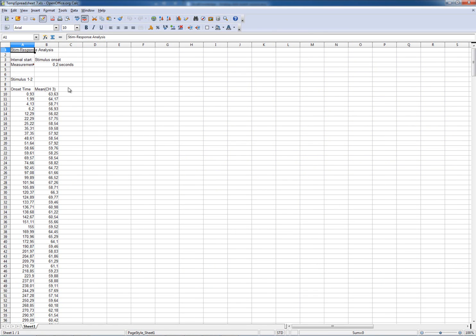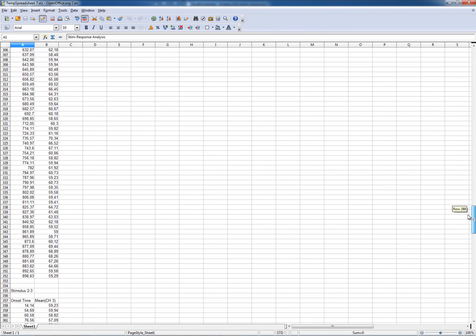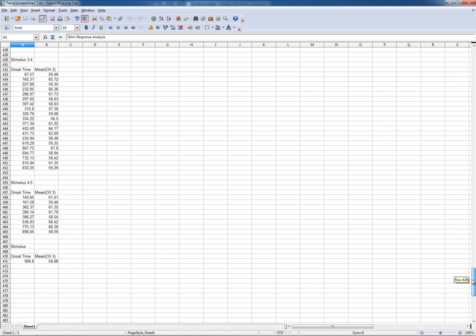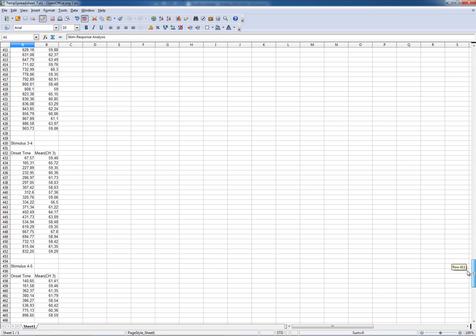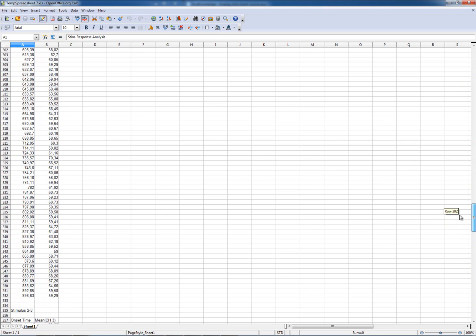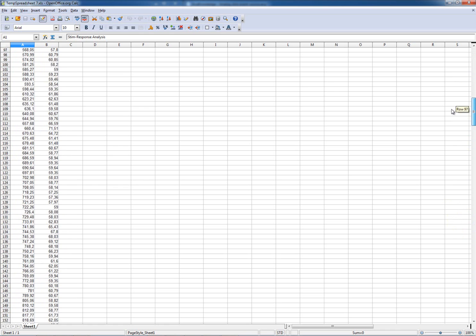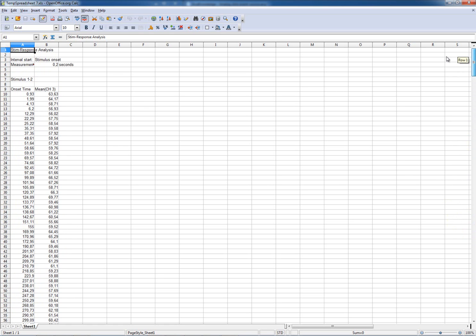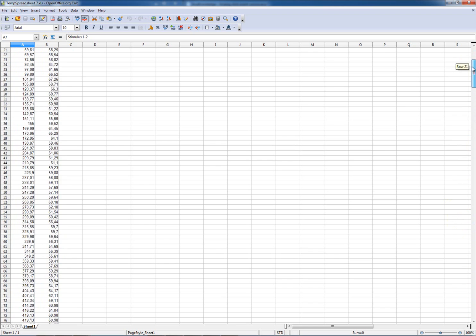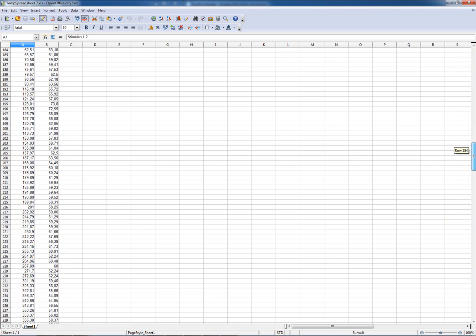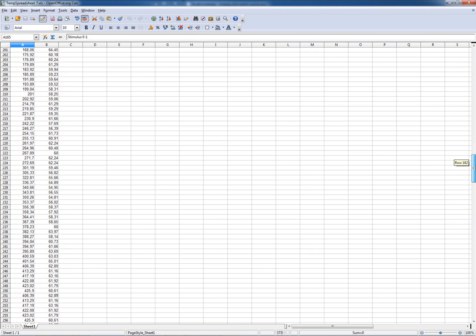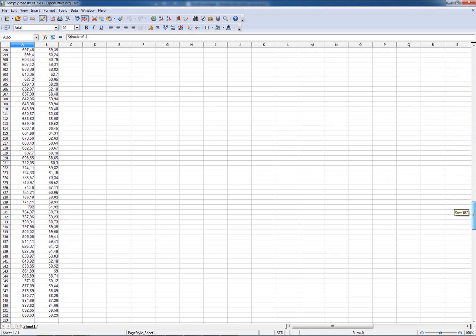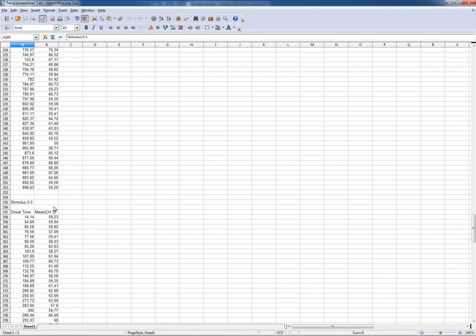And here we have the result. You can see a summary for all the categories. We have stimulus in the range of one and two volts, zero and one, two and three, and so forth.